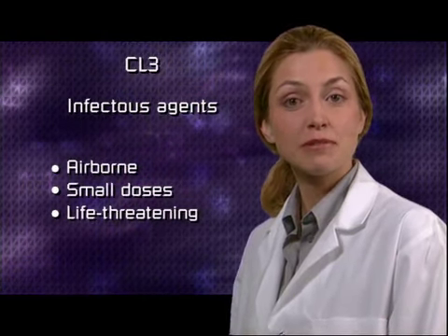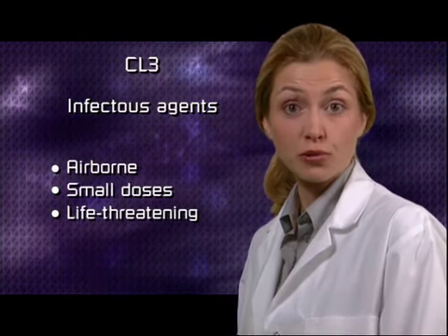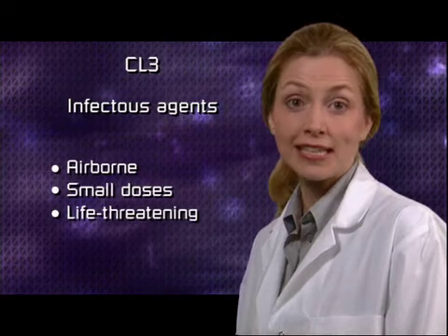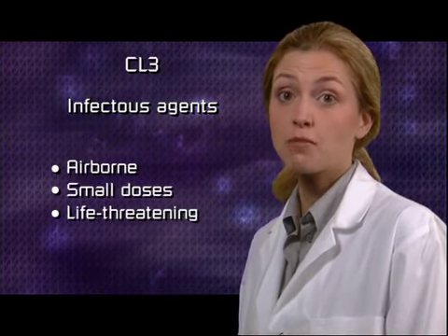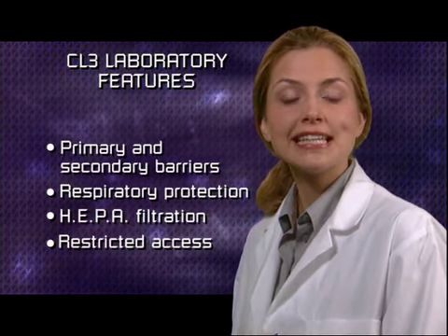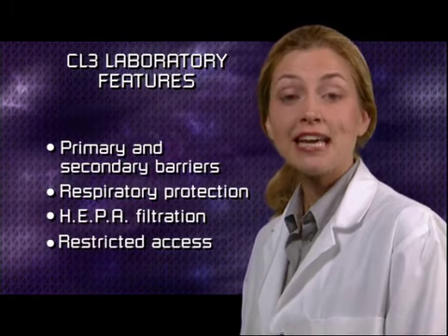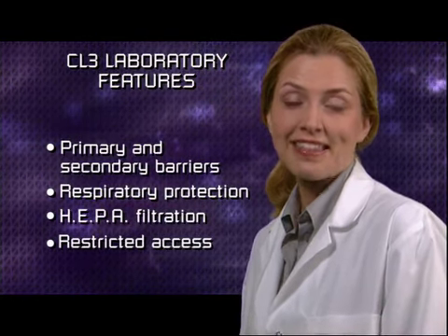In Canada, laboratories are assigned a containment level from 1 to 4. As the containment level increases, so must the necessary safety measures. A lab is designated as containment level 3 when it can handle agents that can be transmitted by the airborne route to produce serious or potentially life-threatening diseases with just a small dose. Containment Level 3 laboratory features are intended to prevent transmission and minimize the release of infectious organisms into the immediate laboratory and the environment.